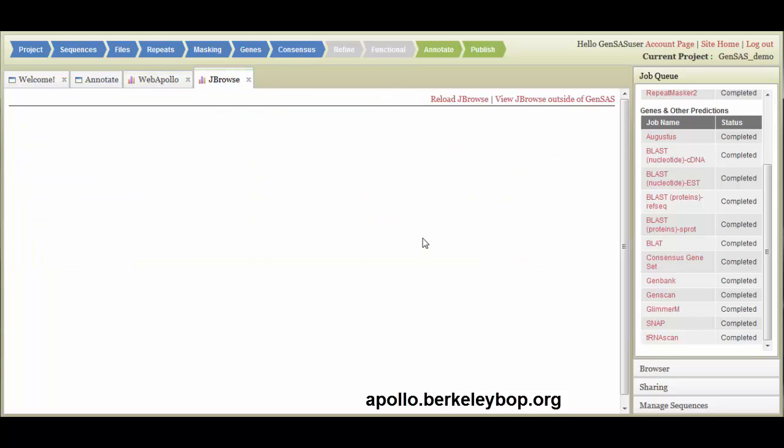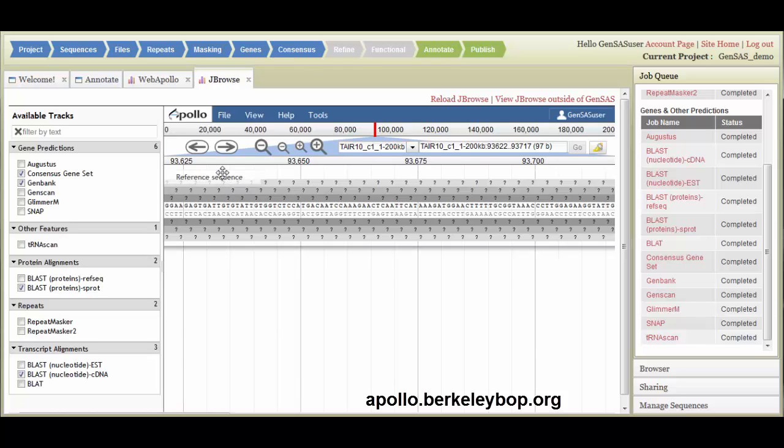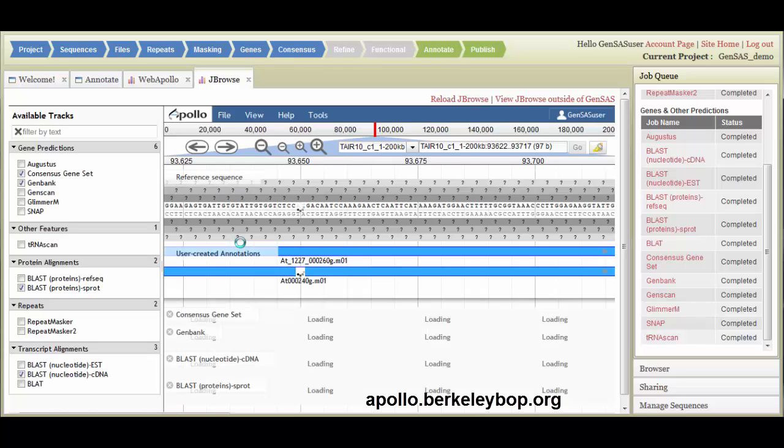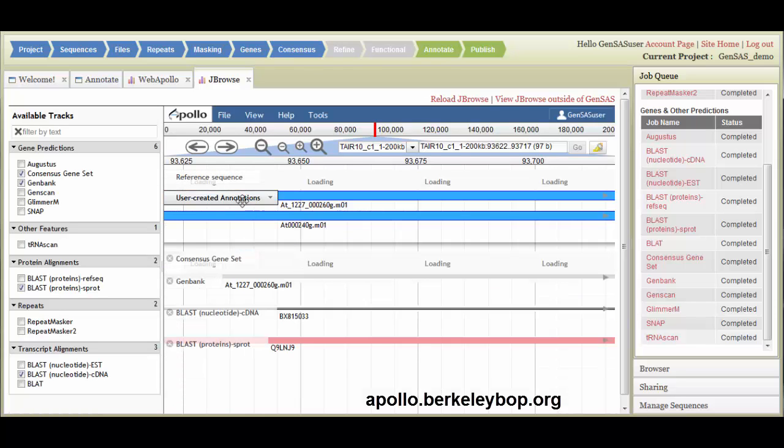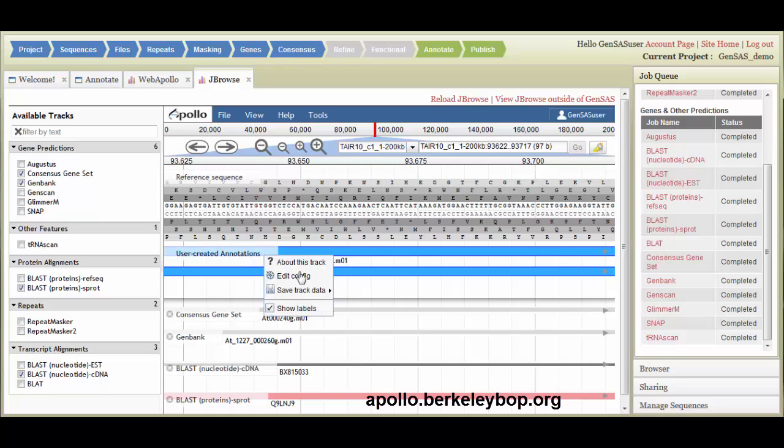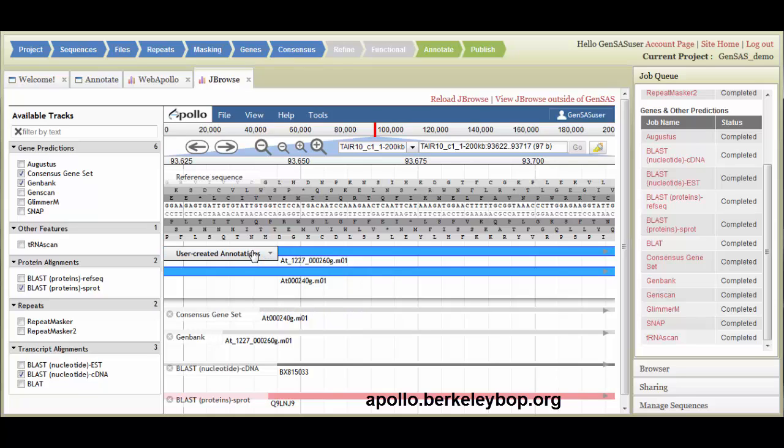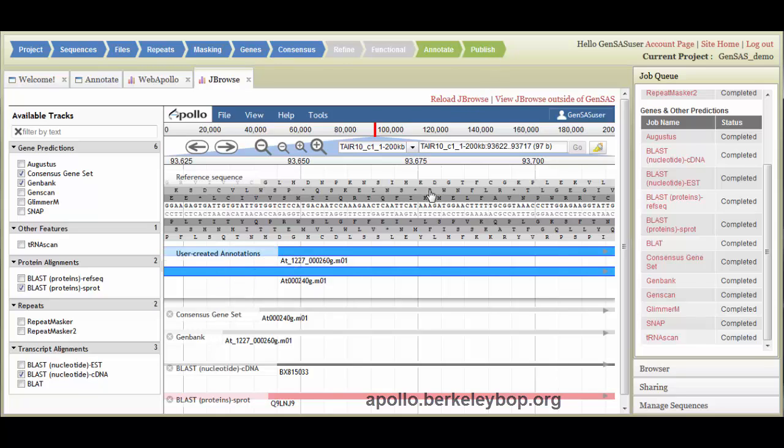Currently, the only way to export the data from the user-created annotation track in GenSaaS is through WebApollo. And to do that, you just need to click here, save track data, and choose GF3 or FASTA format. In the future, GenSaaS will export this into our Publish tab, but that's a function that is in progress.